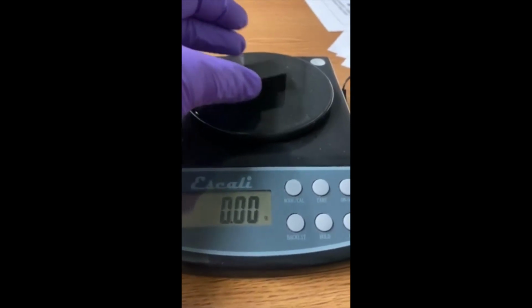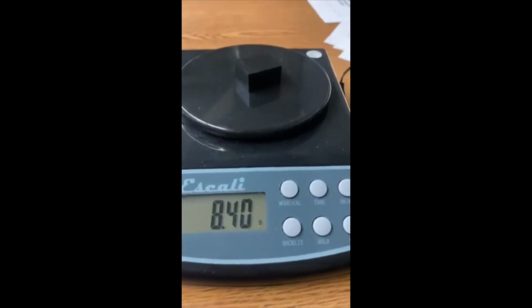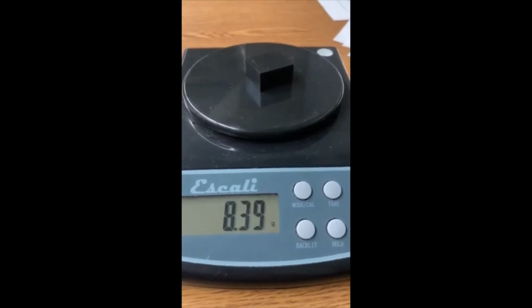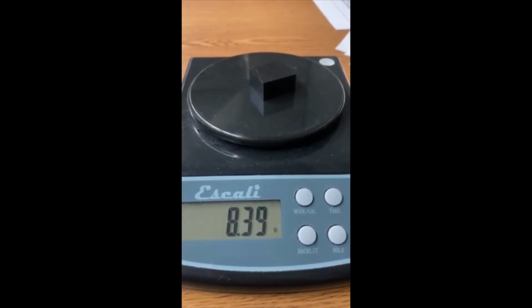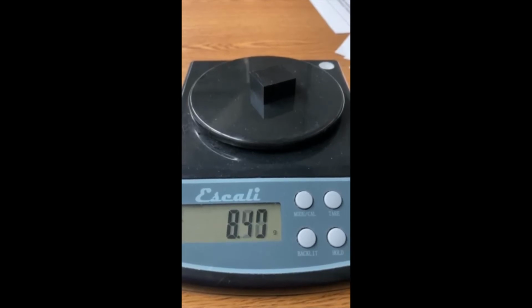As you watch the video for each sample, record the dimensions measured and the weight of the samples to be incorporated into your spreadsheet to be used to calculate the modulus. In addition, keep track of the variations in the measurements to allow you to assess the potential errors in the calculations.